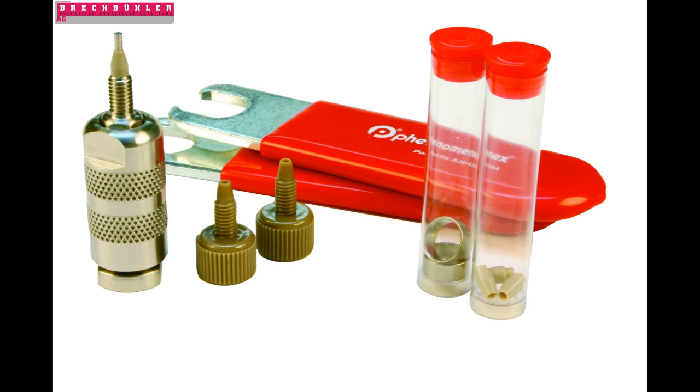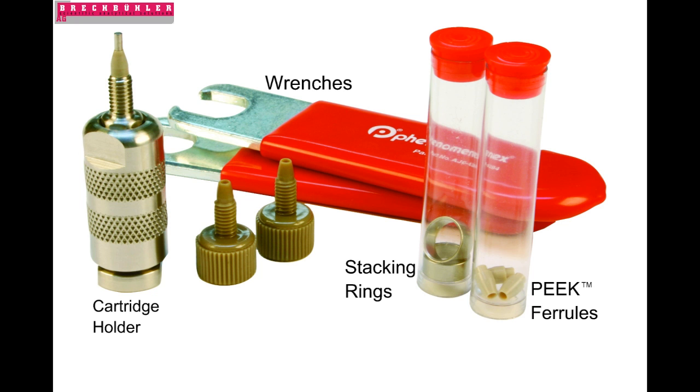Before we begin, let's take a look at your Security Guard System Kit. In the Security Guard System Kit, you will find the following parts: Security Guard analytical holder, Security Guard wrenches, Security Guard peak ferrules, Security Guard stacking rings, and two peak finger-tight fittings.